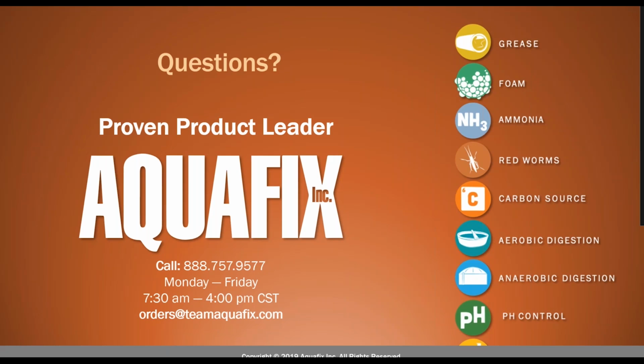So a question here, do all filaments cause foam? Why is it important to know the actual cause of foaming by microanalysis? So all filaments do not cause foam. There are typical foaming filaments such as nocardiiforms or Microthrix parvicella, but it's important that all filaments are not immediately going to be causing foam.